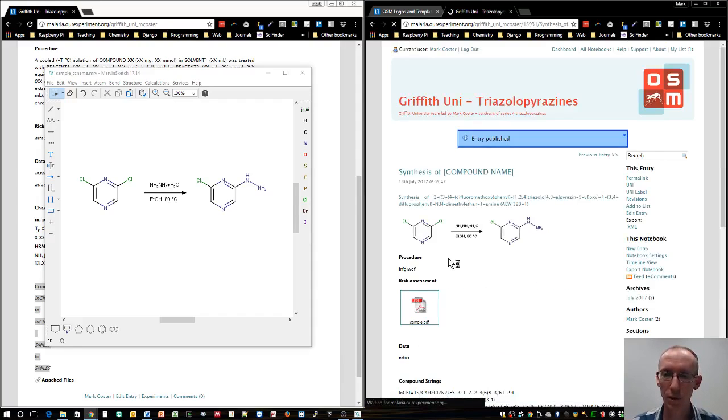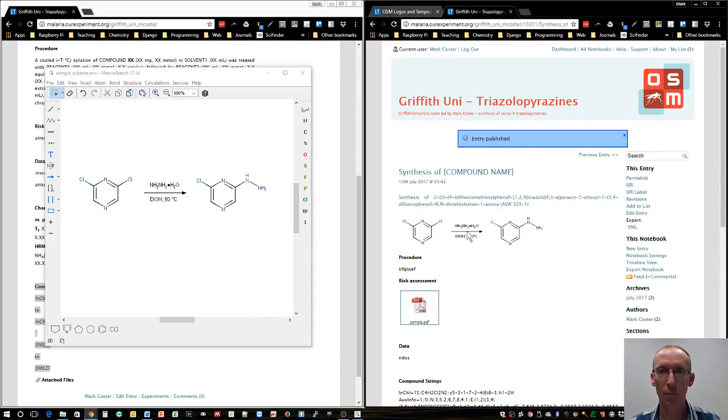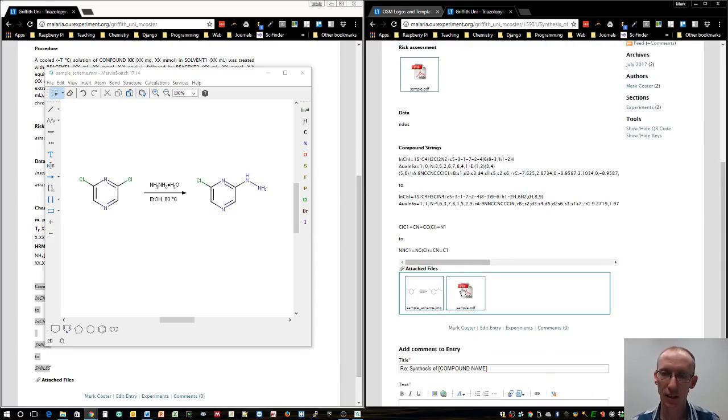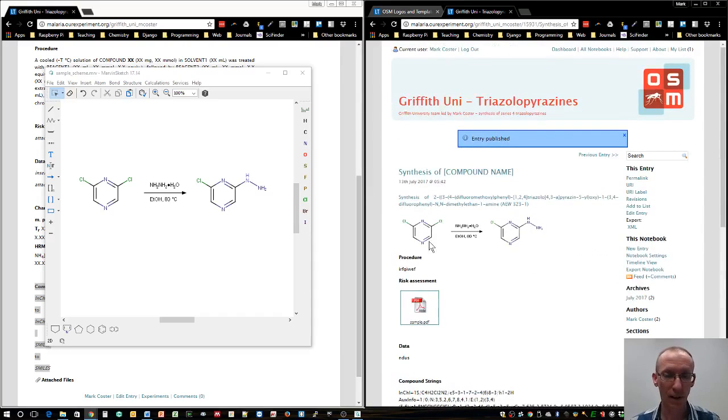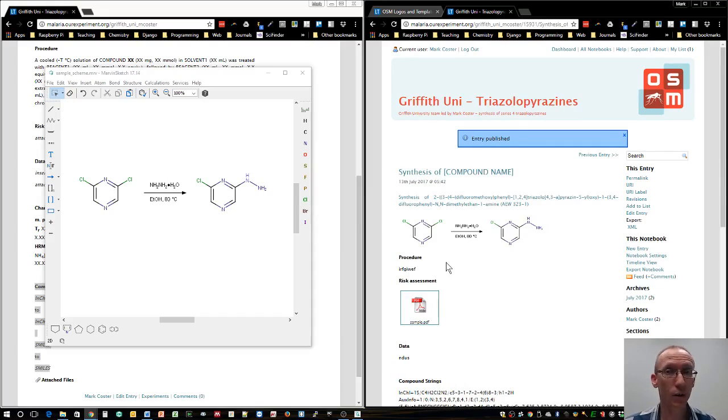You can click save for later if you're going to be updating this lab book entry, or you can click publish if you're going to make it publicly available and put up onto the lab notebook section. Click on publish, and now that is a new lab notebook entry that anyone can visit. You can go back and make adjustments to it. Okay, that's it for today. Good luck with your synthesis.